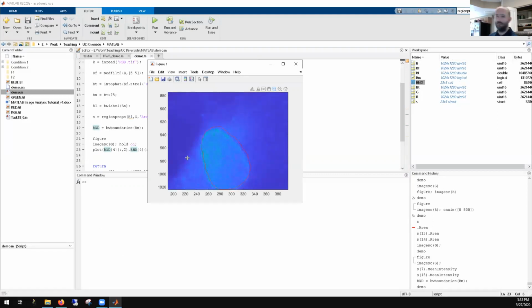And honestly, this looks pretty decent. You're often going to see a slight shift like this, where it's a little embedded on one side compared to the other. It's a little too tight on this side and a little too loose on this side. This has to do with how the boundary gets resolved when you plot it. So you're always going to see this subtle rightward shift, so I wouldn't worry about that if you see it. But overall, you can see that this really does map the nuclei well.